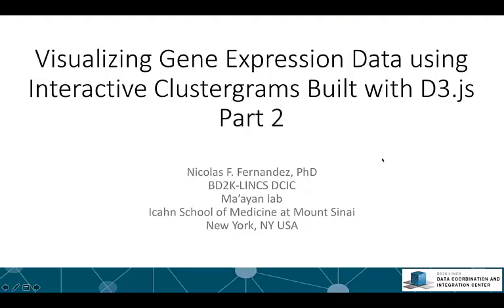Hi again, and welcome to part 2 of visualizing gene expression data using interactive clustergrams built with D3.js. In this part, I'll be discussing network visualizations and clustergrams.